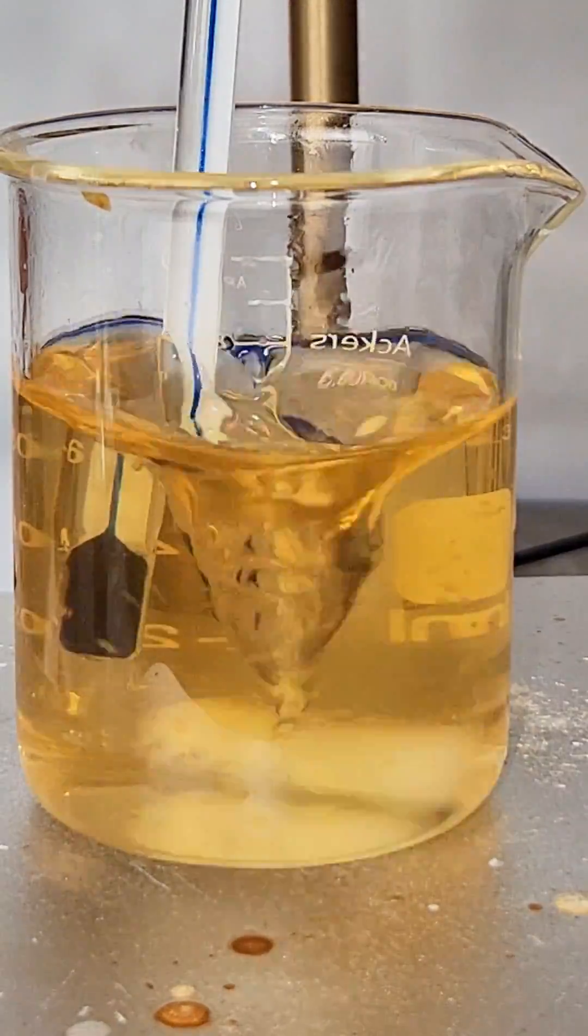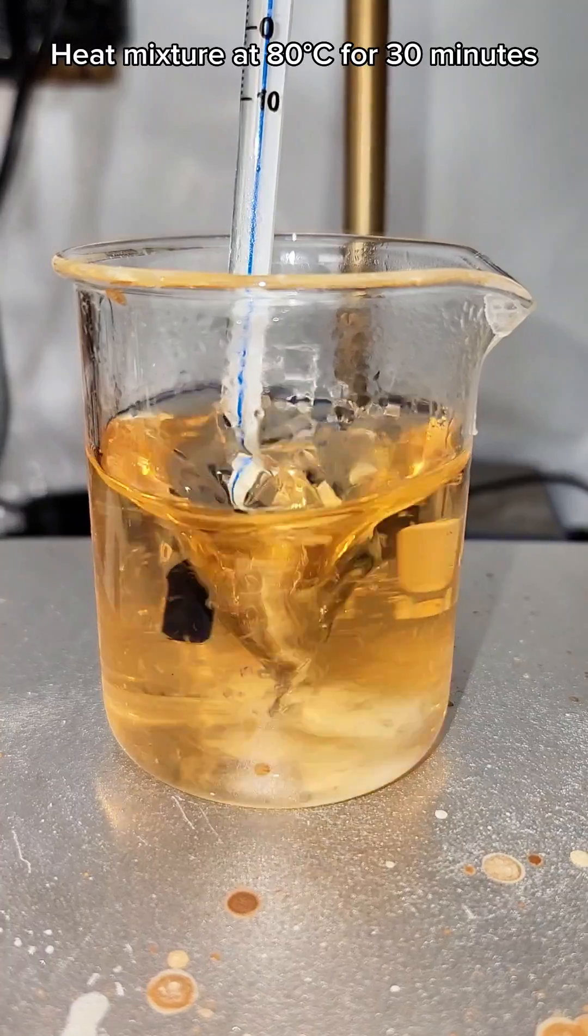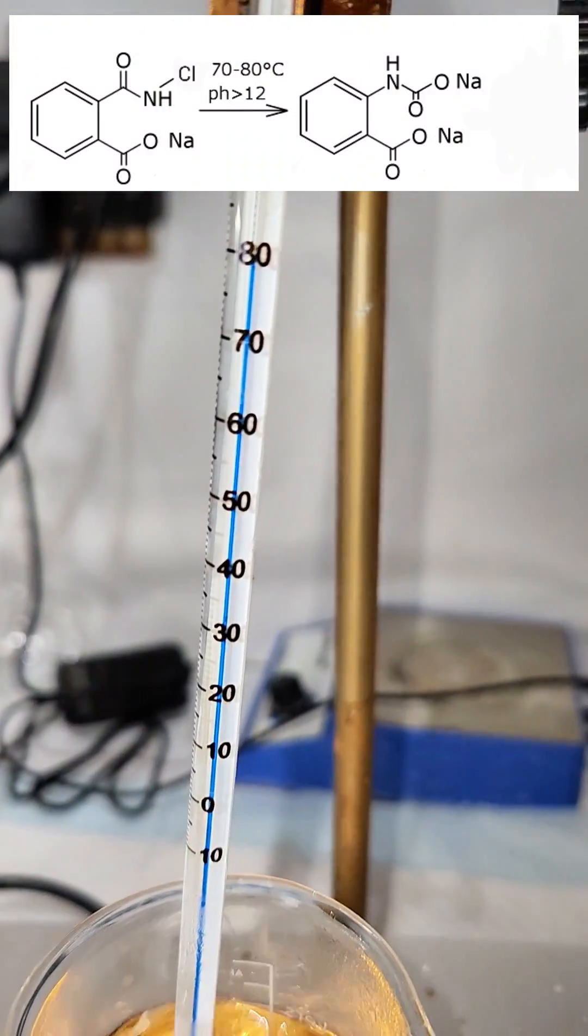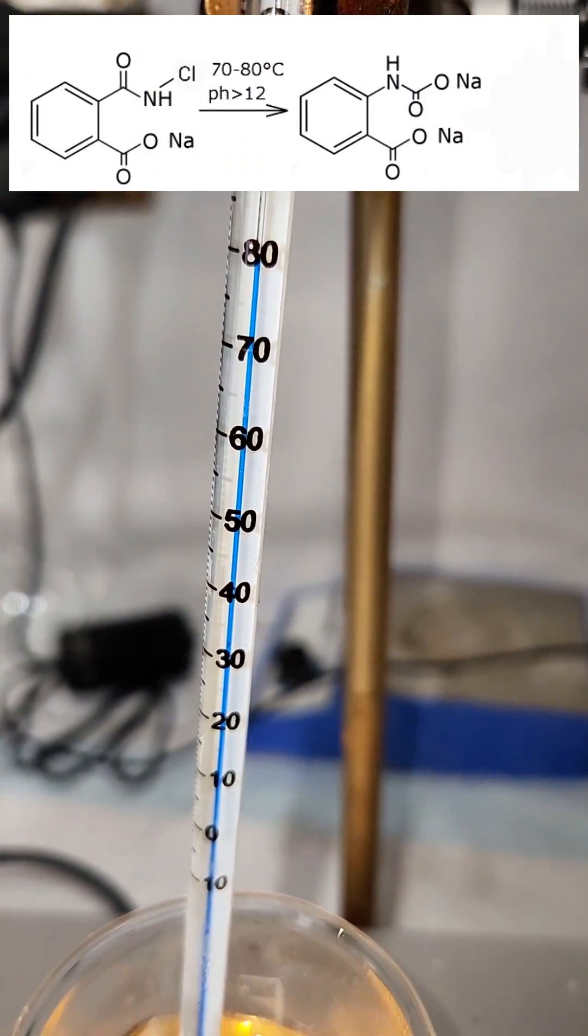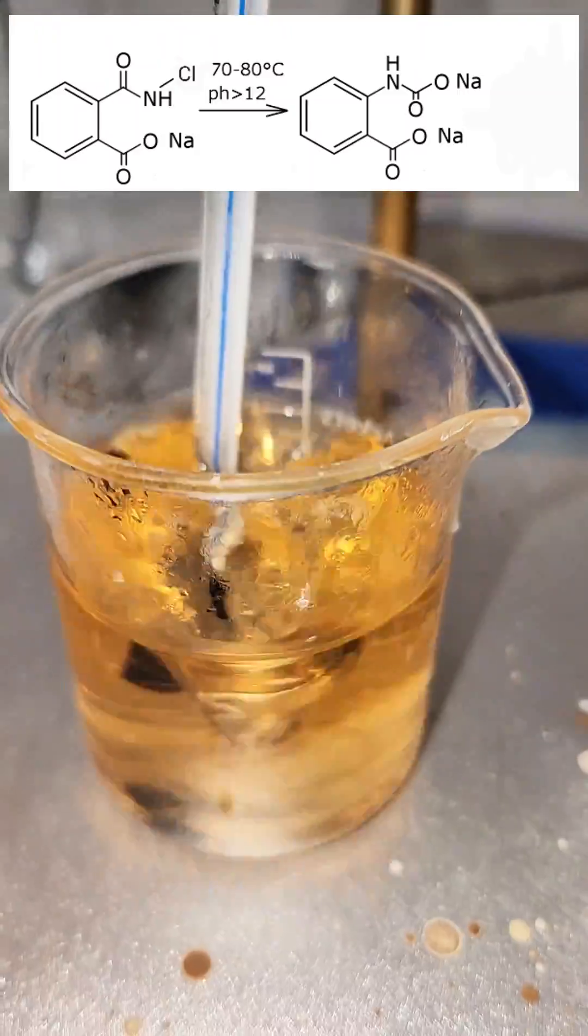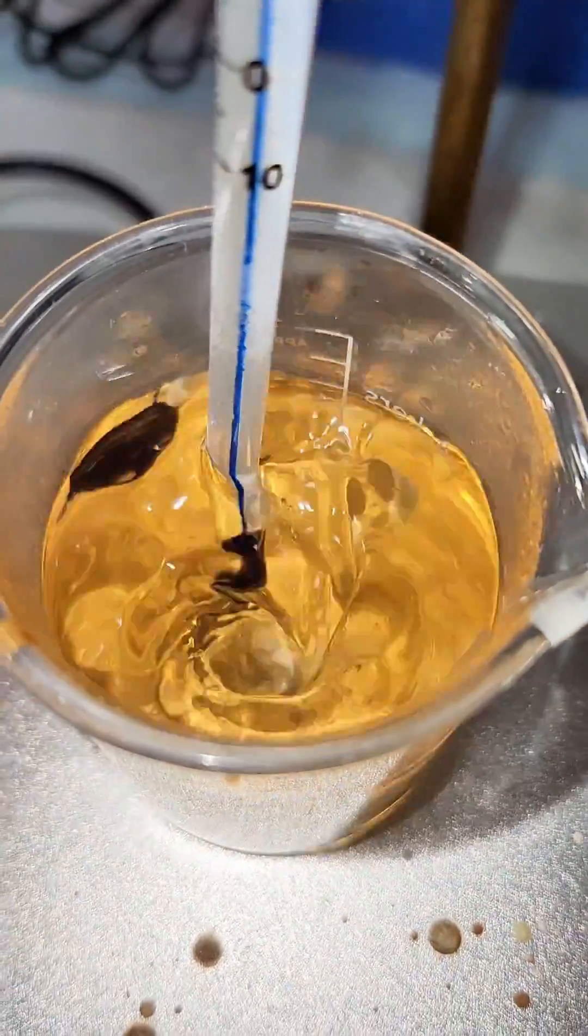This temperature is held for 30 minutes and during that time the chlorine is replaced with a carboxylate group. This sodium carboxylate salt is fairly insoluble and might precipitate out if you lost too much water during this step but it's not a big deal.